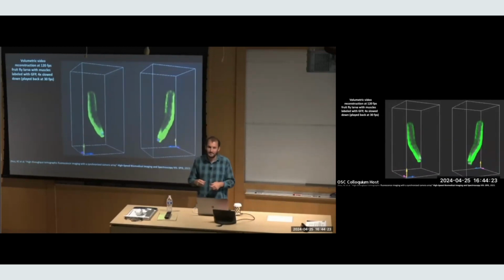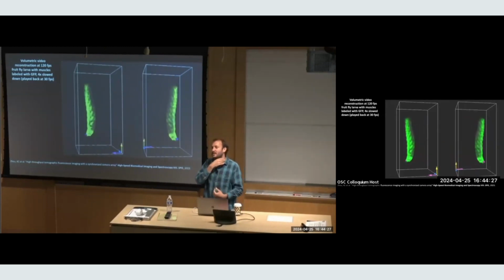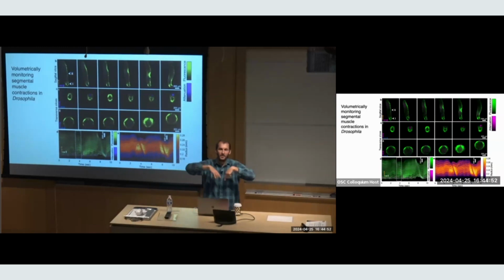That's this event or biological phenomenon called peristalsis. It's the same thing our throat does when we swallow. It's a very fundamental biological process that worms, many hundreds of millions of years ago, started to do, and now we do. And this lab was interested in studying those, so we've been creating these plots of the radius and also the rippling, which you can observe here as a function of time, by measuring around that volume and watching it contract over time.